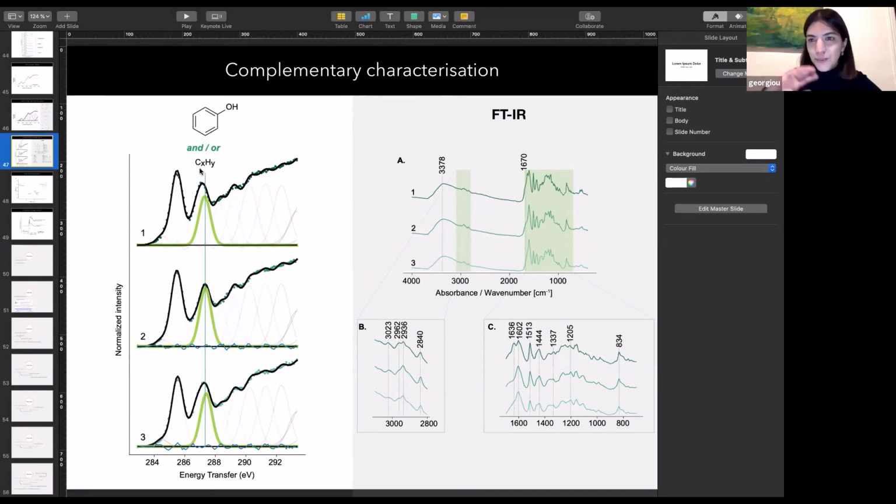A transition from an aliphatic group, because the energy range overlaps for this transition. I was able to go to the FTIR and say that, okay, we have a small feature coming from aliphatics, and we have here a signal coming from a phenolic.